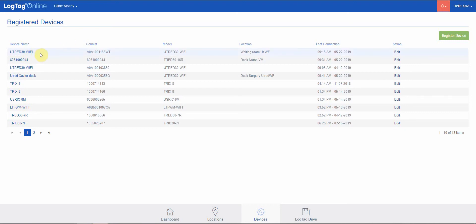The ordering is such that the newest logger registered is at the top. The last logger registered will be at the top of the list. You see the device name, which defaults to the model of the device.